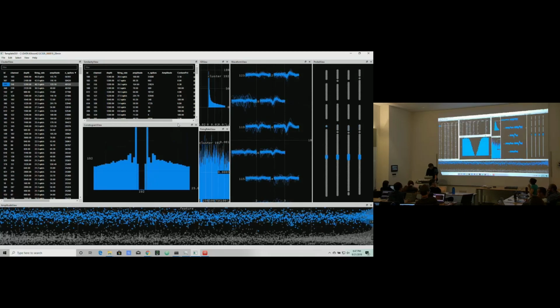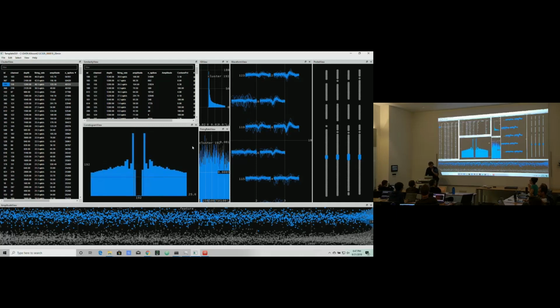What would you expect to see if there were multiple neurons firing in the ISI view? Okay, forget about that one for a second. Who knows what that's for. We'll figure out a use for it. The correlogram view is the one you really want to look at. And it would just be flat all the way across. If it's really, really flat, then it's probably not just 2 neurons together. It's more like multi-unit activity background.